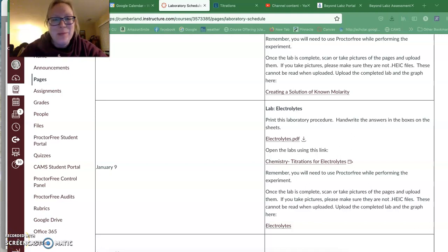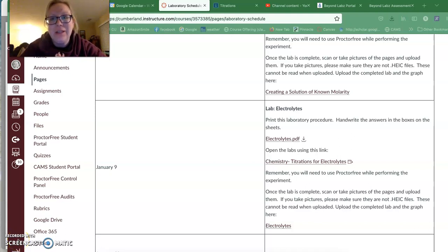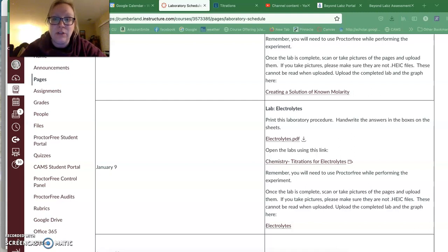Hi, in this lab we are going to take a look at measuring the electrical conductivity of different substances to determine if they are electrolytes or not.